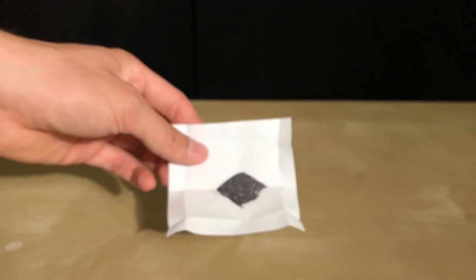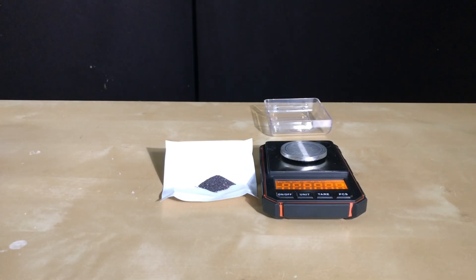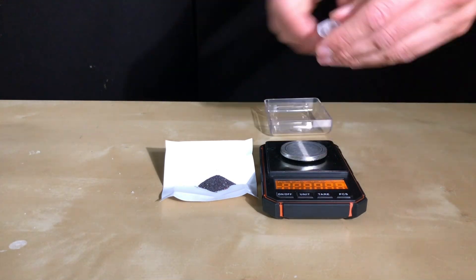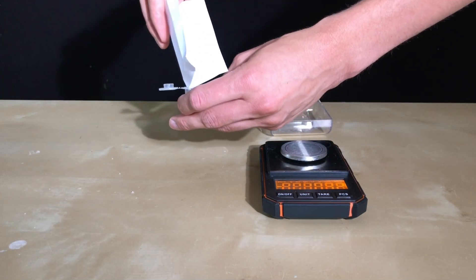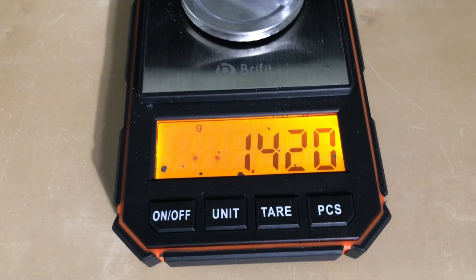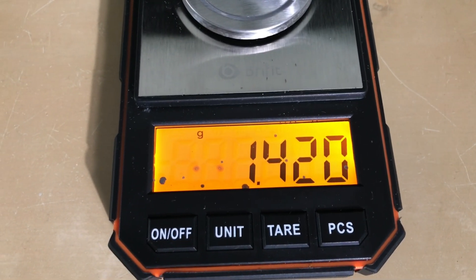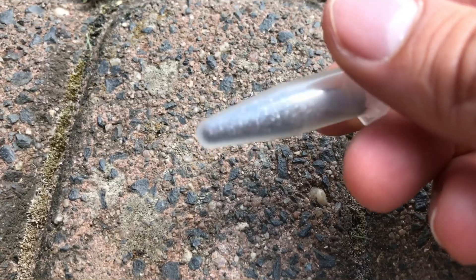Here we can have a look at the violet phosphorus we collected. A vial was put on a scale, set to zero, and the violet phosphorus was added to it. In total we were left with 1.420 grams of violet phosphorus. This means that our red phosphorus contains 14.2% violet phosphorus.